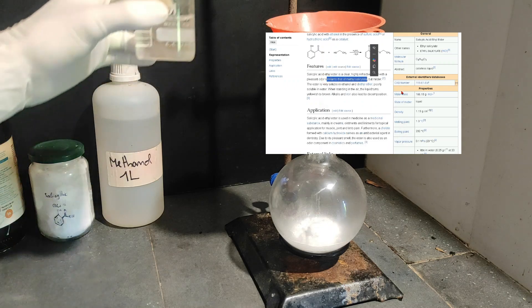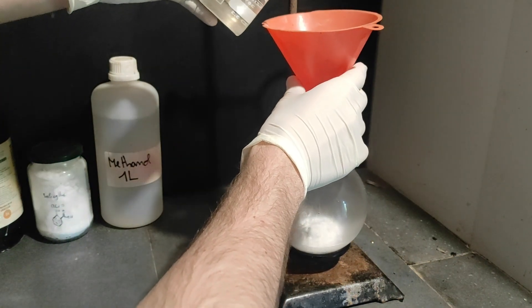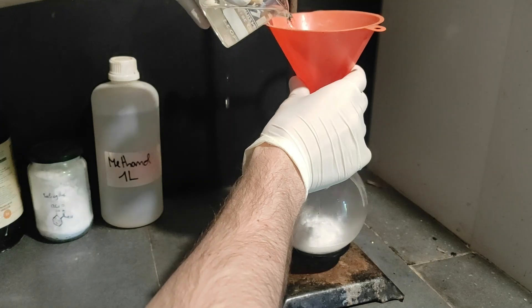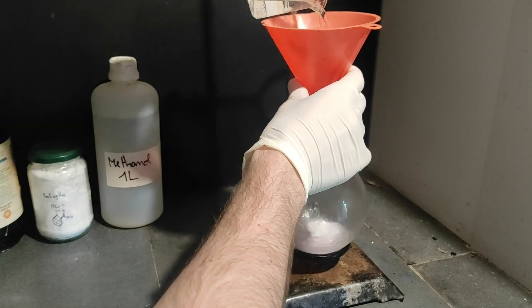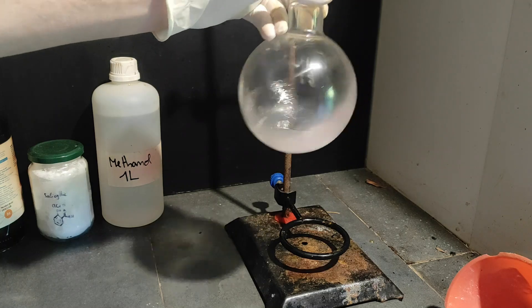You can make 90% ethanol from distilling carefully vodka or some other alcohol. I pour the methanol in the flask as well and you can see that the salicylic acid dissolves very well in it while stirring. Yeah it's dissolving very fast.